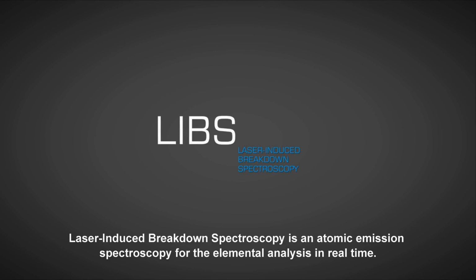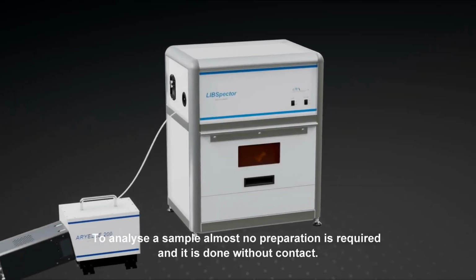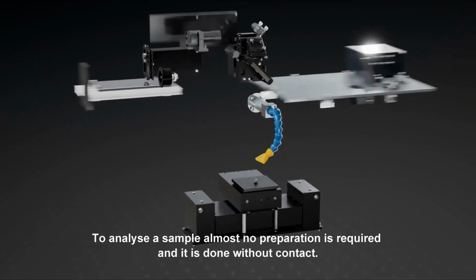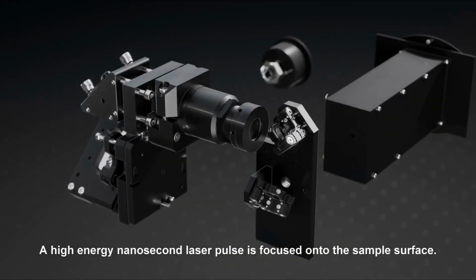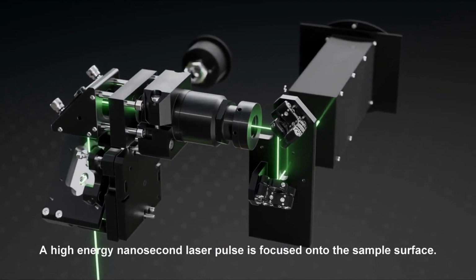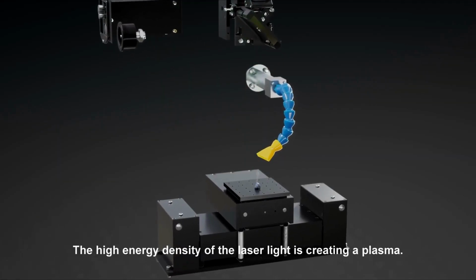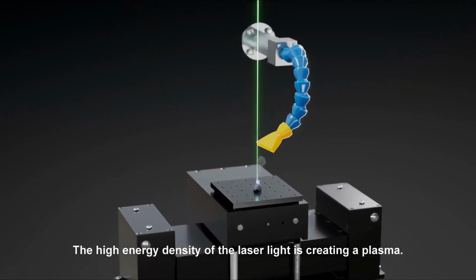Laser-induced breakdown spectroscopy is an atomic emission spectroscopy for elemental analysis in real time. To analyze a sample, almost no preparation is required, and it's done without contact. A high-energy nanosecond laser pulse is focused onto the sample surface. The high energy density of the laser light creates a plasma.